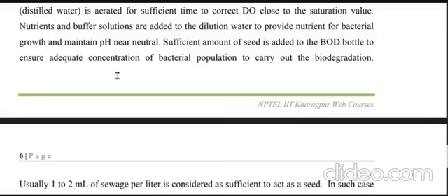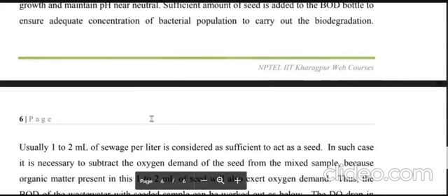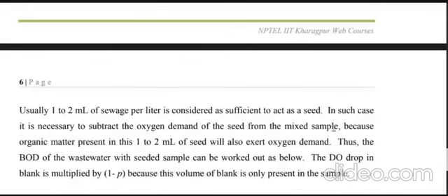For that there is a calculation. Usually 1 to 2 ml of sewage per liter is considered sufficient to act as a seed.